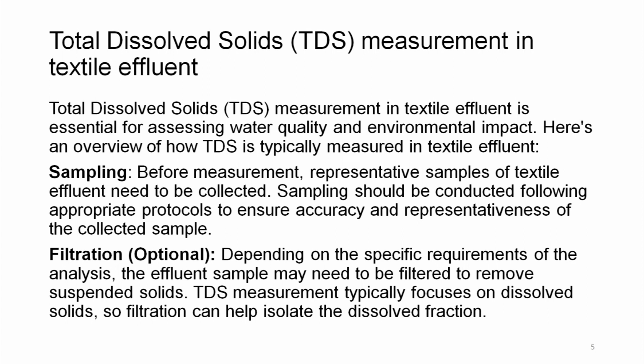Sampling. Before measurement, a representative sample of textile effluent needs to be collected. Sampling should be conducted following appropriate protocols to ensure accuracy and representativeness of the collected sample.